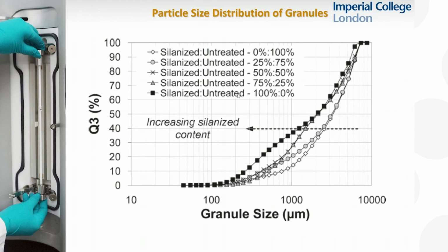However, the silanized material, this is the hydrophobic material where the water does not want to wet it, is shown by the black squares. And that has a size of about 1.5. So in other words, the liquids that wet, because the surfaces are more hydrophilic, give us particles that are nearly twice as big as the hydrophobic particles. In other words, if I've got two formulations and they have all the same chemistry, particle size, and particle shape, then the surface energy will affect granule size by a factor of 2. So that's, in some cases, quite significant.